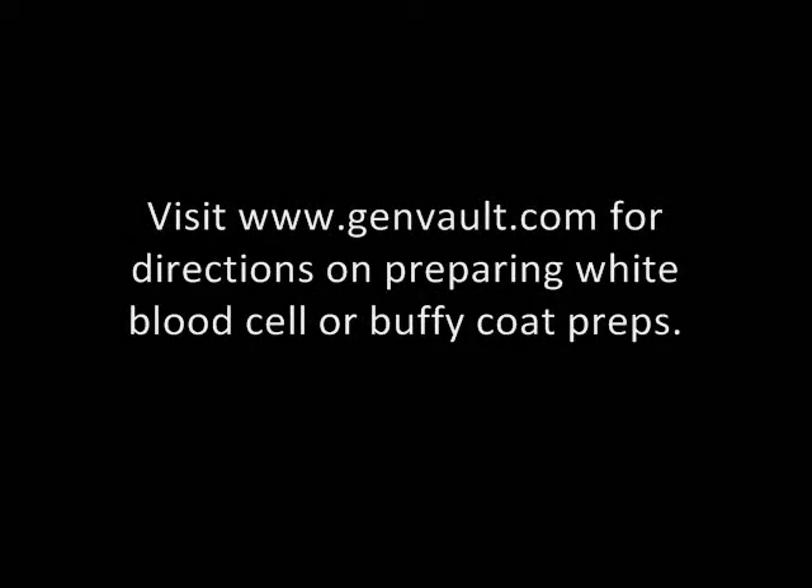In this module we will demonstrate how to apply whole blood and blood products to GenPlates. Start by preparing a sample. Please visit genvault.com for directions on preparing white blood cell or buffy coat preps.